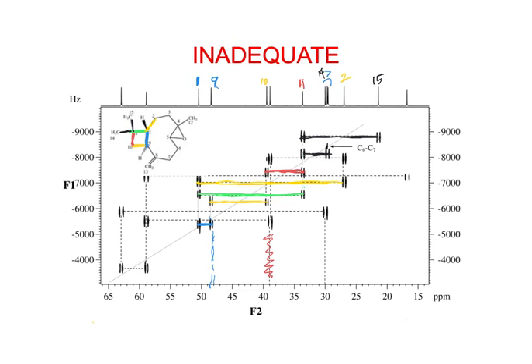Okay, and then 2 has another coupling, 2 to 3. All right. 3 right here. 3, if we go down to here, we got that one. It's going to come down here. So this has got to be 4. So these 2 are on the epoxide, I think.